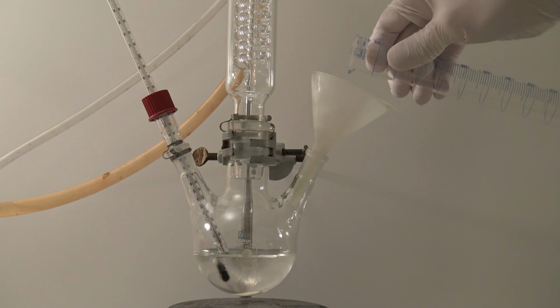Then the hydroxide solution was added further. On the dropping funnel, a colored compound was formed which might have been fumes of acetaldehyde reacting with the hydroxide. While the hydroxide was added, the solution slowly became colored. To the cooling water, more ice was added occasionally. After the addition, the mixture was stirred for 3 hours at room temperature.